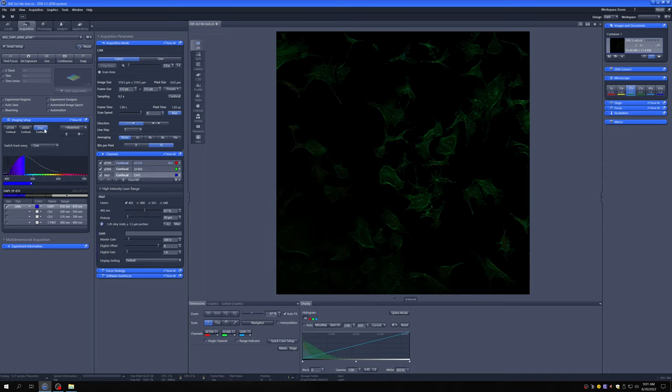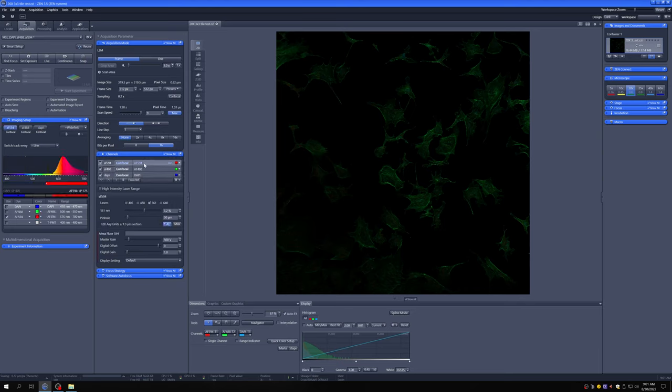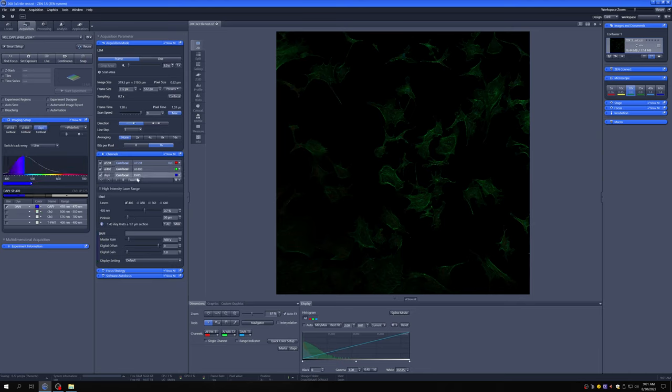And finally, we are exciting with the 405 laser, collecting the light lower than 470 nanometers in wavelength and sending it to the third detector on the system. And we are alternating what we use line by line. So we're scanning one line with the Alexa Fluor 594 setting, one line with the Alexa Fluor 488 setting, one line with the DAPI setting, and then for the next line, we repeat this process over and over until we acquire a full frame.